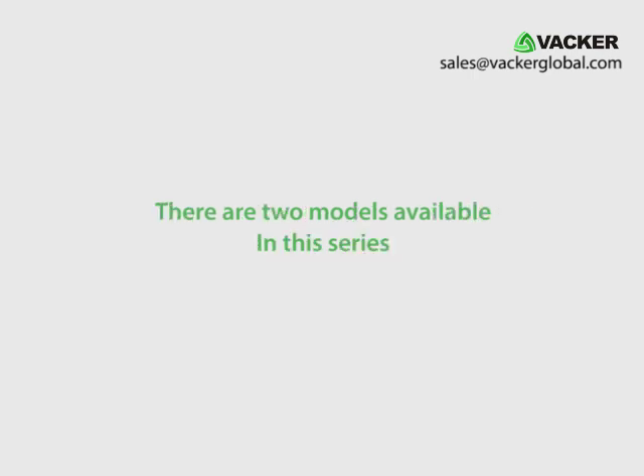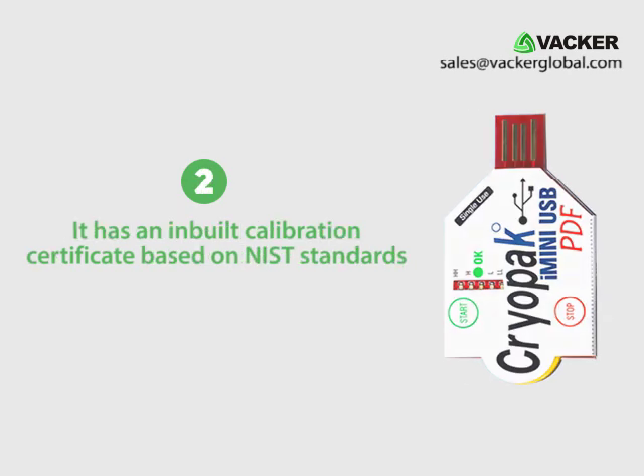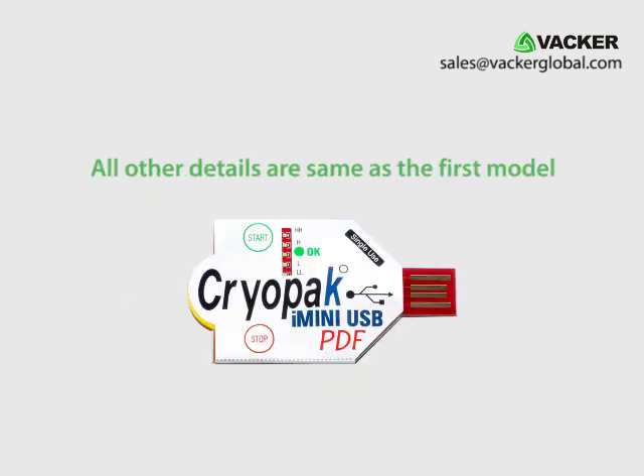There are two models available in this series. The first one comes with a test certificate from the factory. The second model has an inbuilt calibration certificate based on NIST standards. You can view the calibration certificate upon generation of the report. This calibration report shows the error in readings along with the serial number of the particular data logger. All other details are the same as the first model.